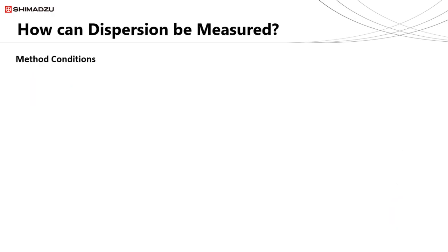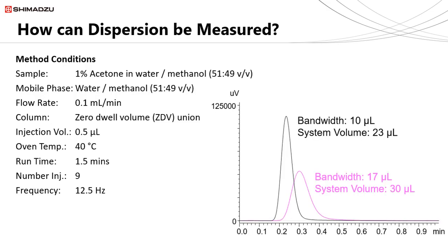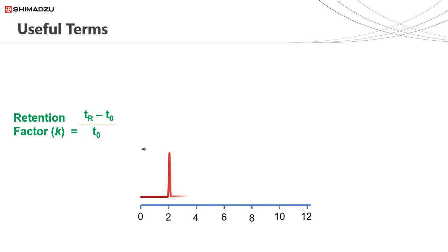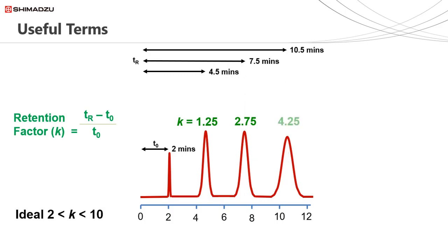In session 4, we established how the dispersion of the system is needed to understand the system in order to develop methods. We need to have our compounds suitably retained with good peak shape. Experimentally knowing the system with details such as dispersion and bandwidth of the peak will allow us to know what types of columns and particles we can use. Knowing the maximum pressure of our system is also essential. This will allow us to then choose the correct system parameters to have suitable retention using the correct column for our method. We looked at how we can calculate the retention factor and selectivity ratio from a chromatogram, allowing us to determine the validity of the methods we build.